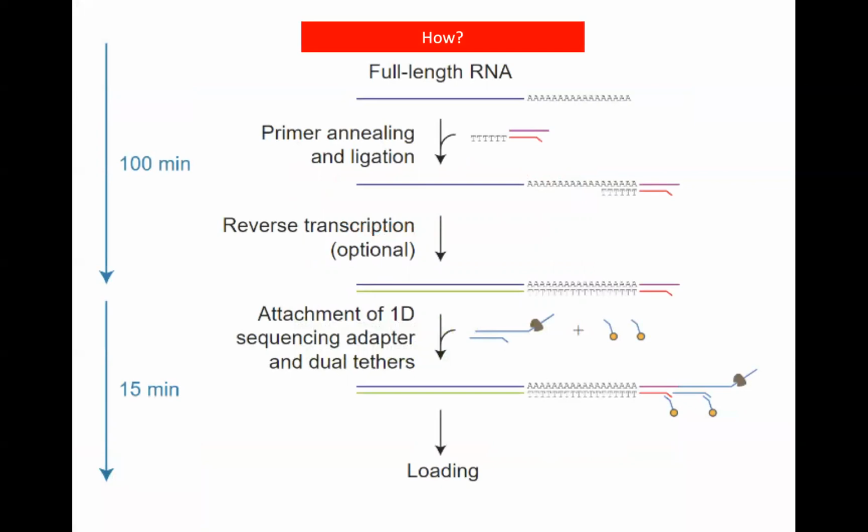So how can we do this? In order to understand what improvements we should make to this protocol, we first have to understand which are potential bottlenecks in the standard protocol regarding identification of many non-coding RNAs. And one particular bottleneck is size enrichment. This is because very often standard RNA extraction protocols do miss many short RNAs that may be less than 200 nucleotides, which, for example, means that we may be missing tRNAs.